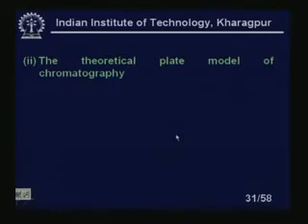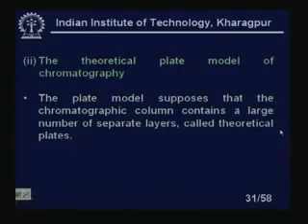In the theoretical plate model of chromatography, we are assuming that there are separate plates, but actually it is not so, it is a mixture. So the plate model supposes that the chromatographic column contains a large number of separate layers called the theoretical plates.